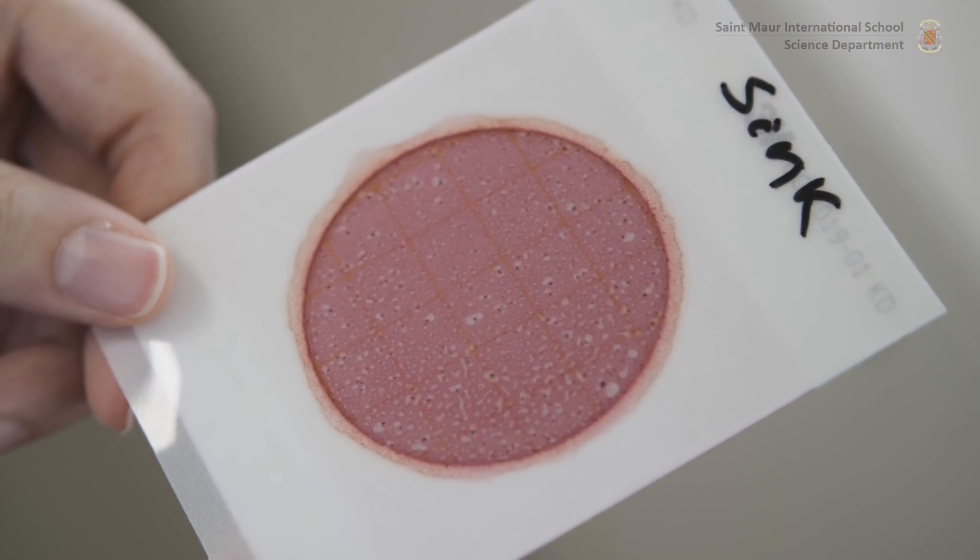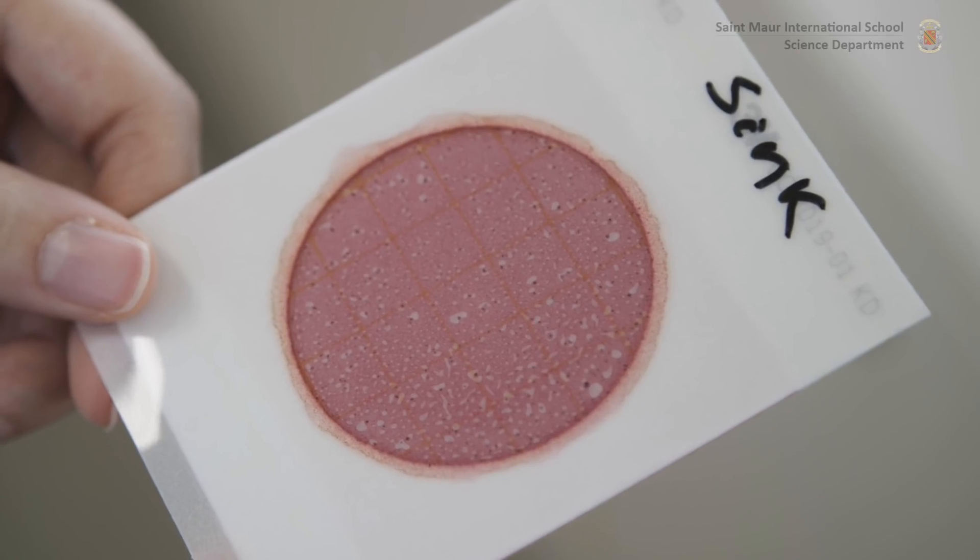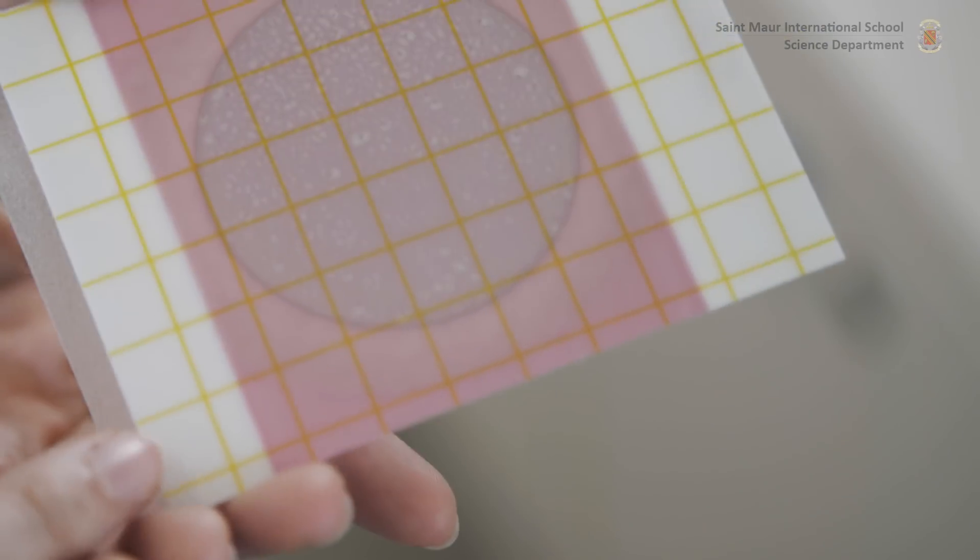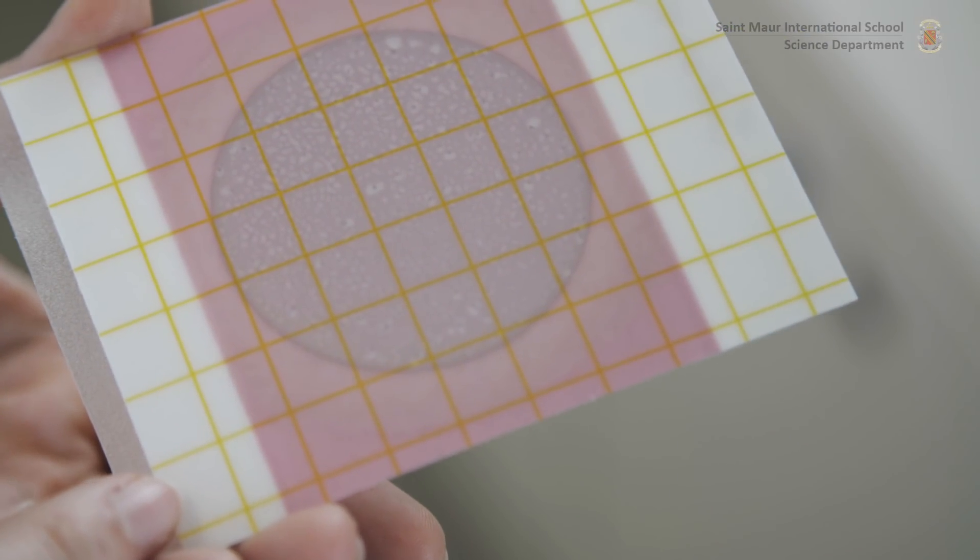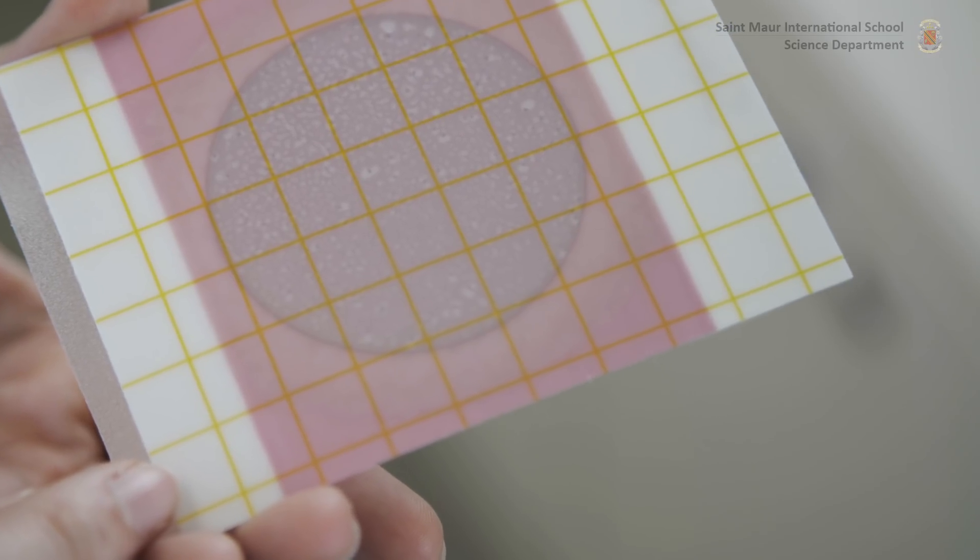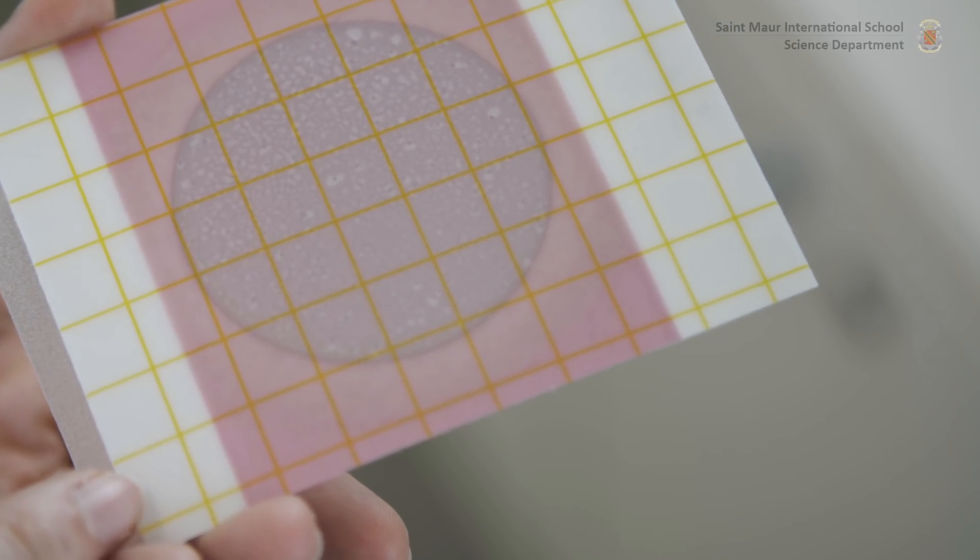Coliforms will appear as red colonies with or without gas production and can be estimated either per square centimeter using the yellow grid as reference or relative to the initial volume of inoculum.